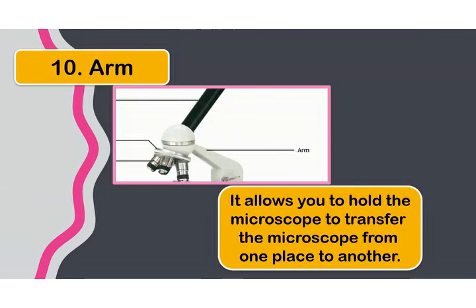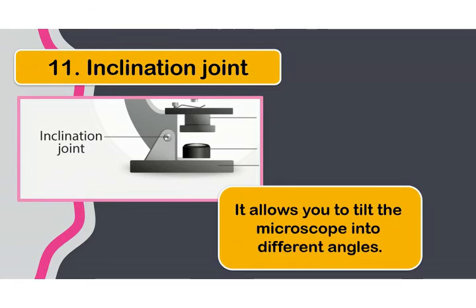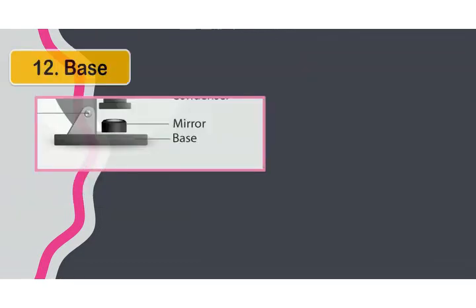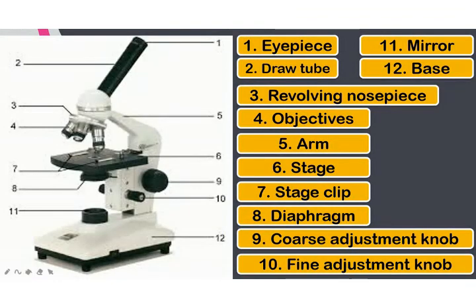Next, the arm. The arm allows you to hold the microscope to transfer it from one place to another. Then the inclination joint. The inclination joint allows you to tilt the microscope into different angles. And then the base. The base supports the entire body of the microscope.